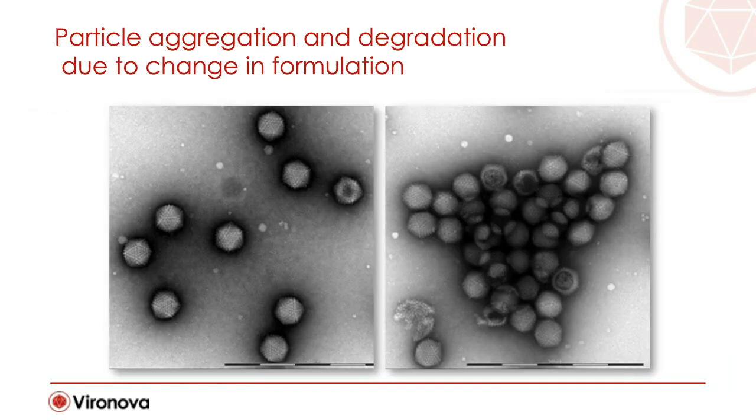During formulation development, if not before, you want to find out your design space. What happens to my particles if I change the formulation in this or that way? Here we have one adenovirus sample in two different buffers.